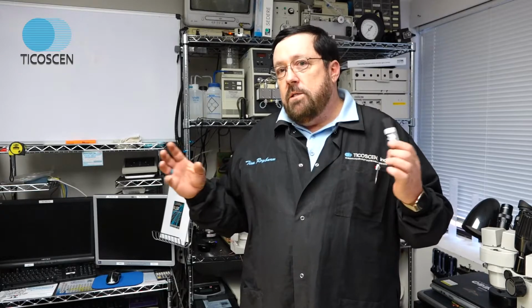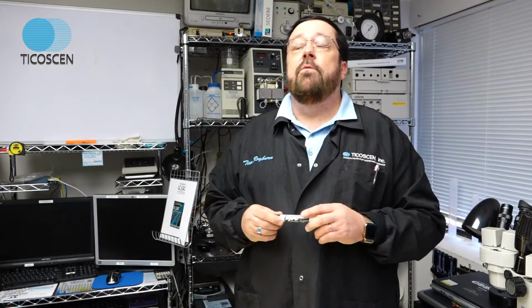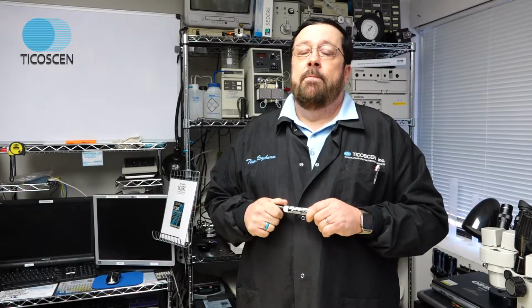It's going to cause noise and scatter light, which we don't want. We don't want any turbidity. So salt causes turbidity. Silica causes turbidity. Life forms in your water cause turbidity. Mobile phases that have high residue after evaporation cause turbidity. On the organic side, chloroform, for example. So all those things will conspire together to take up your dynamic range and cause poor performance issues on your detector. And it could be one of those things, it could be all of those things.